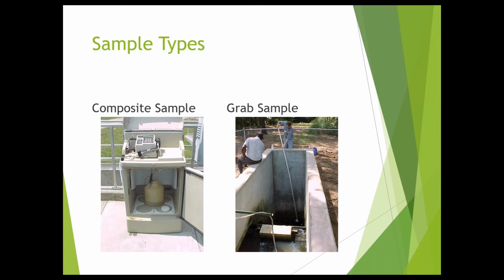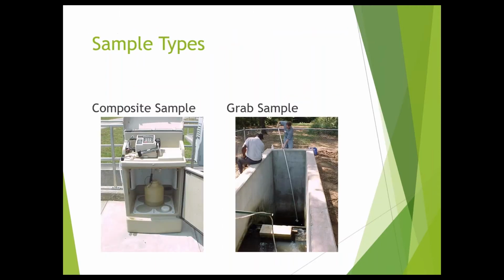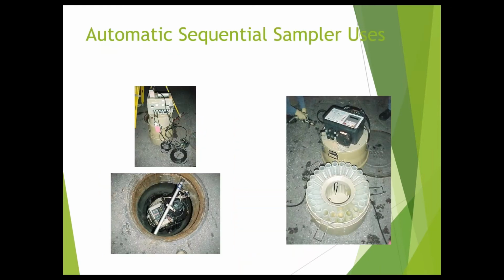And on the left, you're looking at a refrigerated sampler. So far you've seen in this picture here, you're looking at a portable sampler where on this one, the ice would go in that cavity in the middle. You'll see some more in the future. The ice may go around the jar on the outside. This one here, that is basically the same pump that's on top with an igloo cooler beneath it.